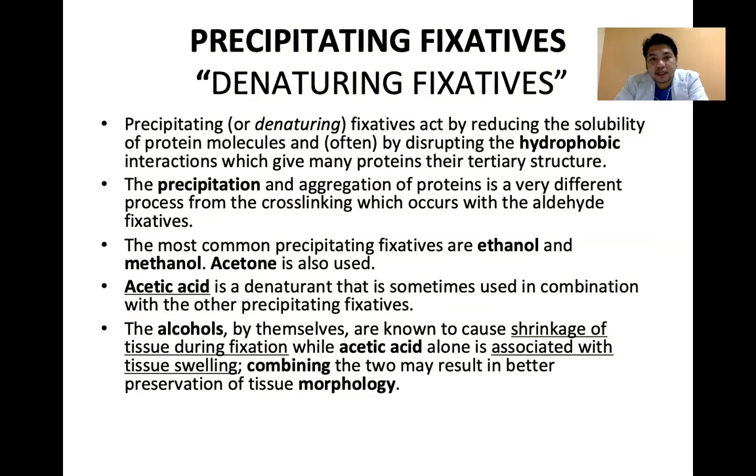Next is denaturing fixatives. Denaturing or precipitating fixatives act by reducing the solubility of protein molecules by disrupting the hydrophobic interactions, which give many proteins their tertiary structures.